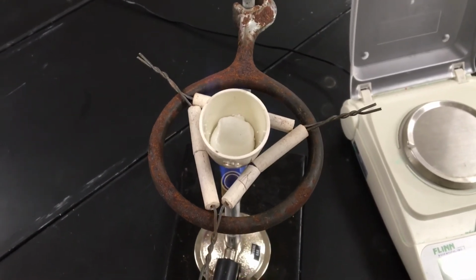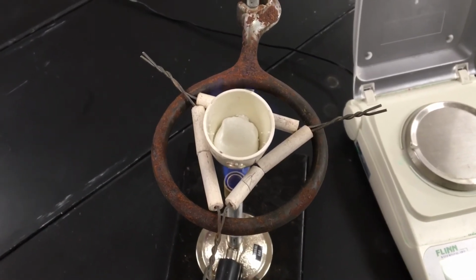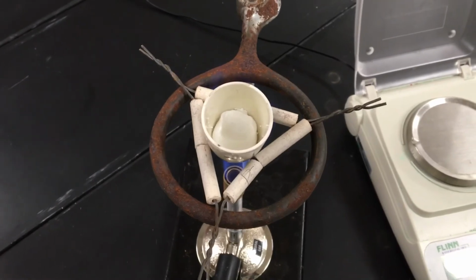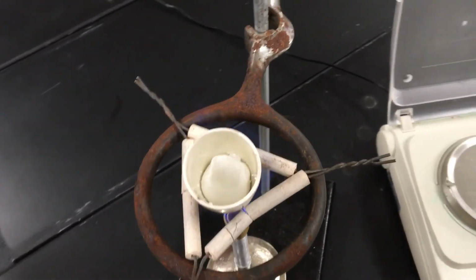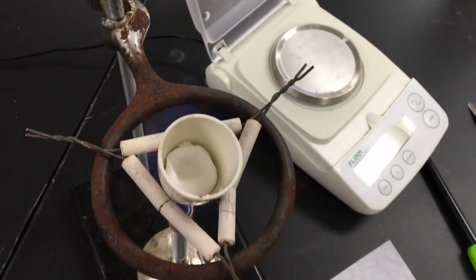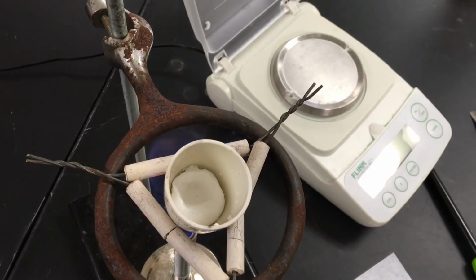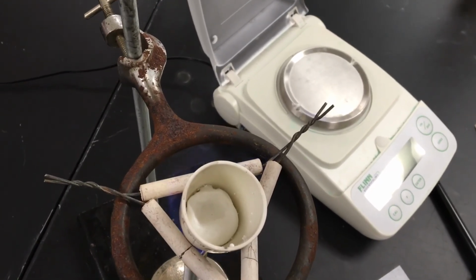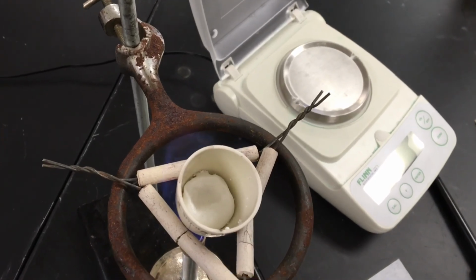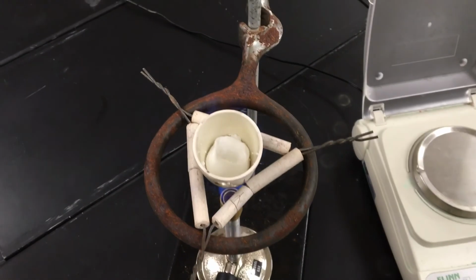I did have a lid. I did remove the lid so that you guys can see the sample, but typically this is run best with the lid, because if you look at the walls of the crucible, you see how it appears that part of the alum, the aluminum potassium sulfate, is starting to almost jump out of the crucible. I wonder if that's going to affect your data at all.